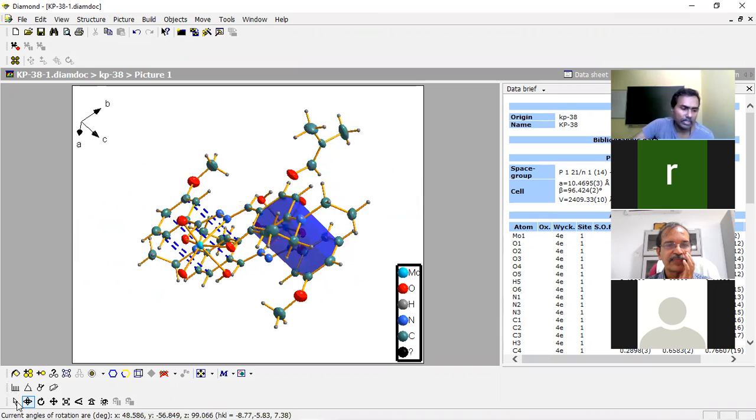So from this we can find out C4S. This is C4S and C4SB. So this hydrogen atom is involved, and we located that hydrogen bond. Now we have to bring the other molecule which is having the CH pi interaction with the CG3 ring of another symmetric molecule, not with this molecule. So that has a different symmetry. Therefore, we have to find that also.